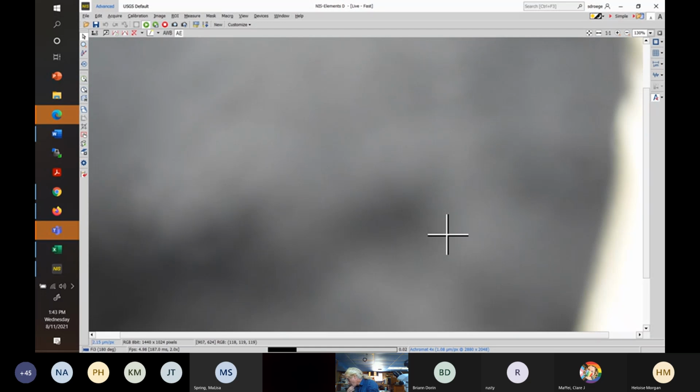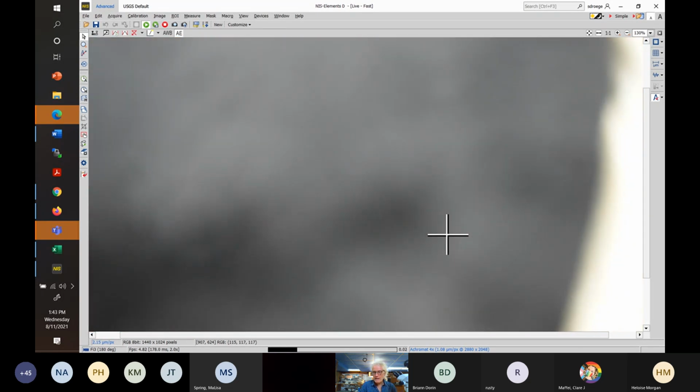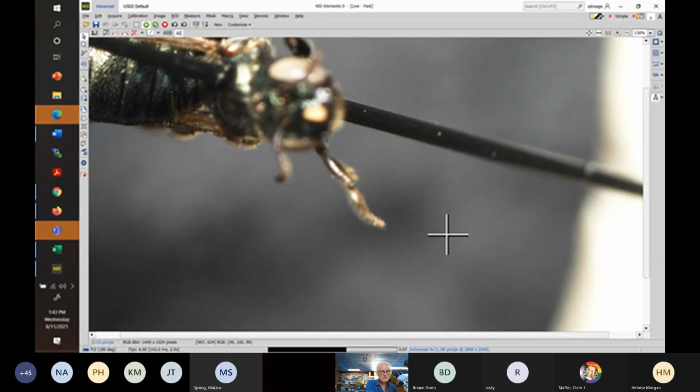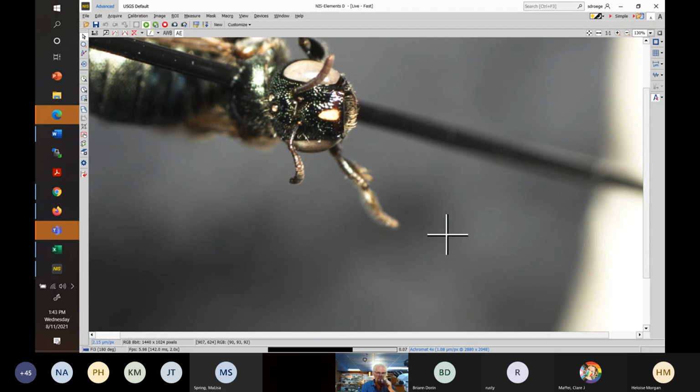Okay, so now putting this away, I'm going to go to dupla. What are we working on here? Is this the female? Yeah. So we're going to go now to the female dupla. If you look at the female dupla, we have, as most of the time, a strong clypeal mark. So probably not calcarata from that.